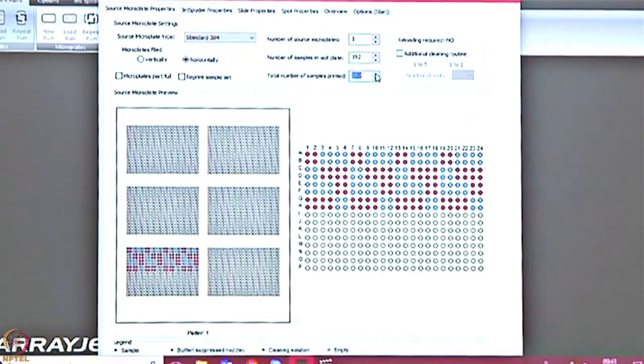Because there are so many different applications, it's actually a very interesting question, and I'll spend another 2 hours telling you how we are doing this mechanism of generating the well plate. So the jet spider needs to fill up one corner of 12. Because it's in multiples of 12, it has to finish the first 12, go to the next 12 wells, go to the bottom 12 wells, go to the next bottom 12 wells. It has to finish one section before it moves printing and takes another set of 12 samples. So that way you are able to save the time it takes to move around. It'll just pick up 12 at a time, finish, go back 12 at a time, and done.